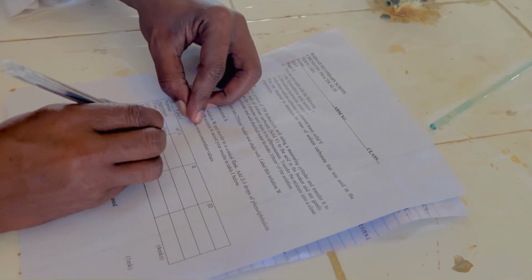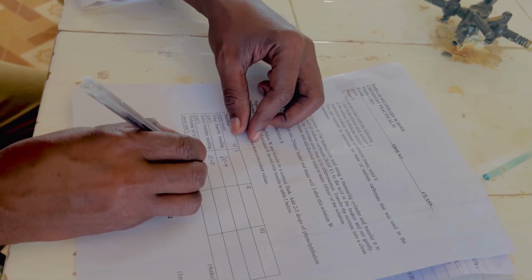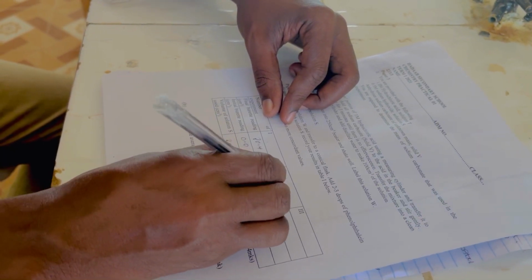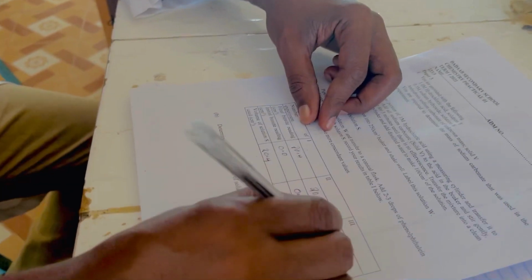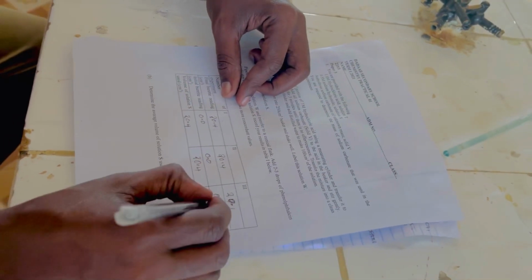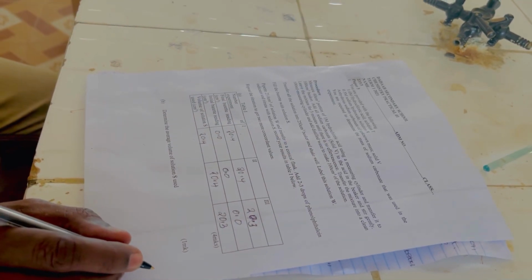Then my final burette reading was 20.4. Then I will subtract and get 20.4. Then I refilled it, 0.0, 20.4, and here is also 20.4. Then 0.0, 20.3, and 20.3 now.